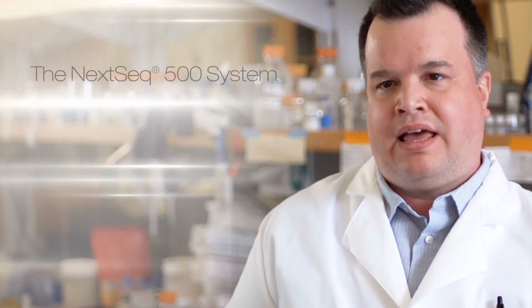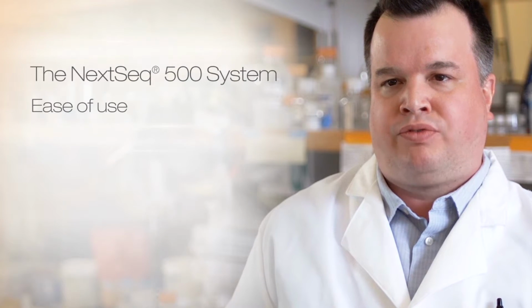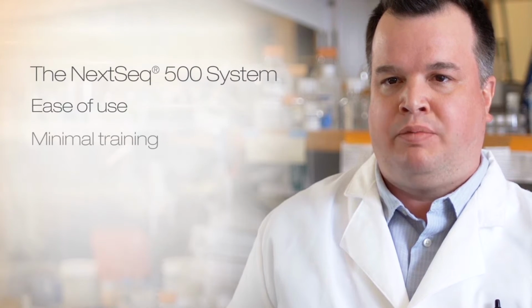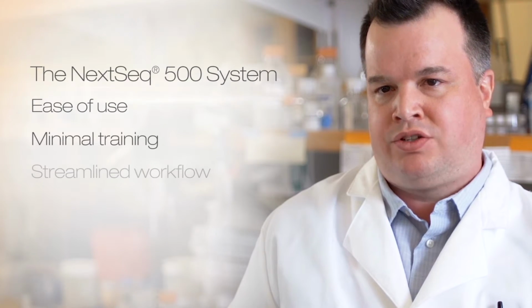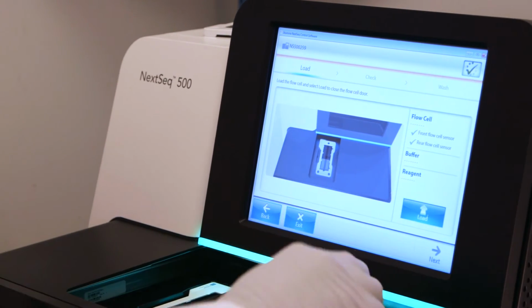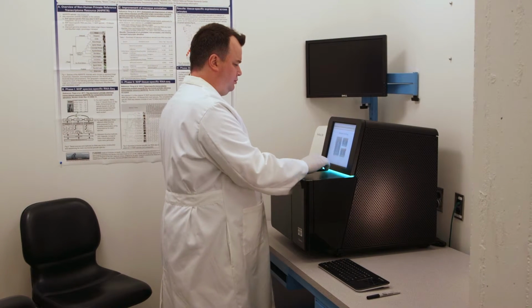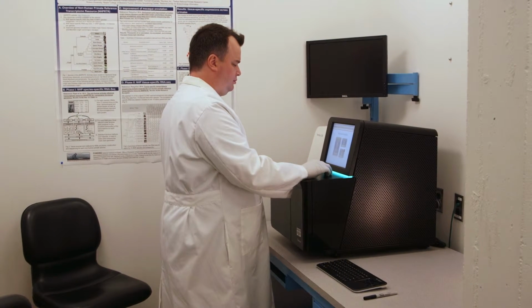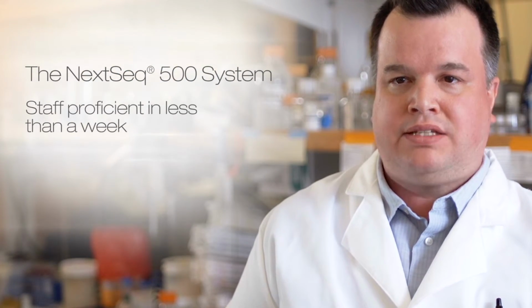The NextSeq 500 had a big impact on the lab because it is much easier to use. It is much easier for me to train someone in the lab and get them up and running in a short period of time. It is much easier for me to leave someone simplified instructions on library prep and loading. The NextSeq 500 allows a scientist to get very high quality data without the hurdle of knowing exactly how to do all the upfront chemistry to get the machine loaded accurately. Generally, I can have someone ready to use the machine without supervision in less than a week.